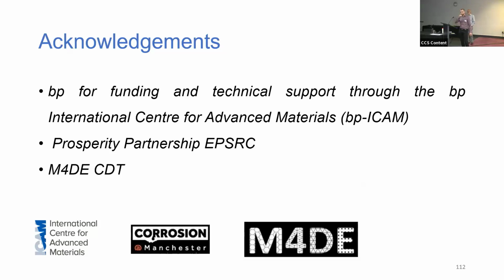Is it after you've done the experiment, are you able to get good EBSD data then? Yes, that EBSD map was taken after it was corroded. I would be tempted to crash your tip right at the end. You're going to change it anyway for the next experiment. Go to somewhere slightly away from the position of interest, and you'll find it straight away in the SEM. Yeah, that is probably true. It's a bit brute force, but I don't want to risk damaging the AFM. I don't know how hard it is. I don't want to do something like that. It's got a quartz crystal on it that I don't want to scratch.